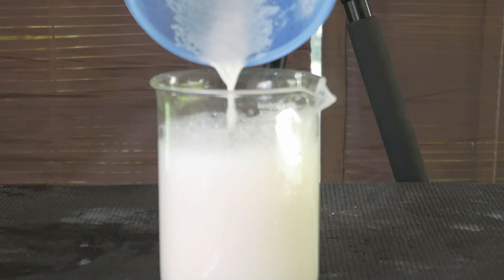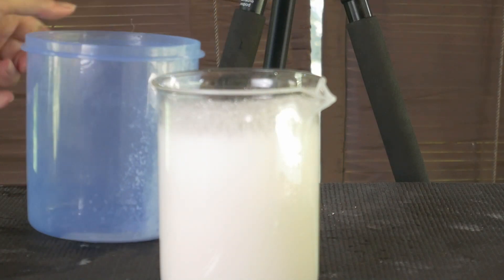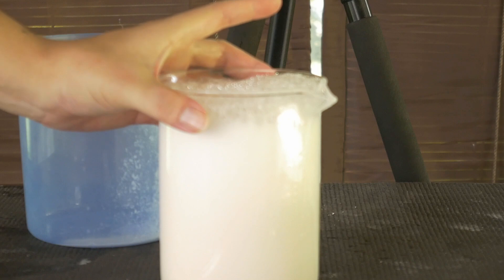Even when I said I was going to pour it slowly, it almost overflowed. But luckily my mixing spoon dealt with the problem.